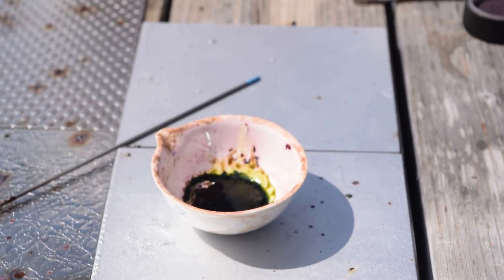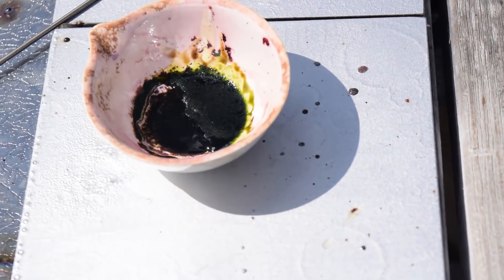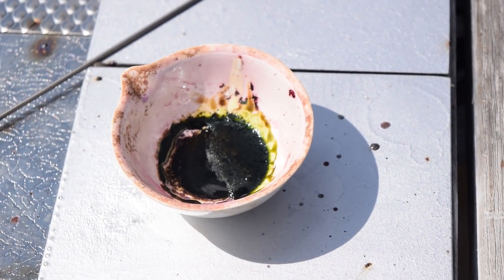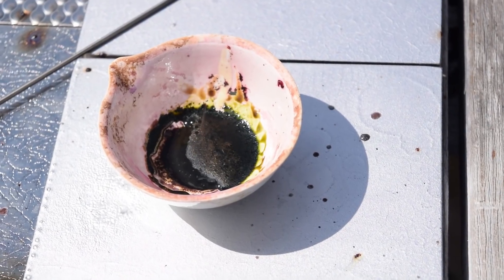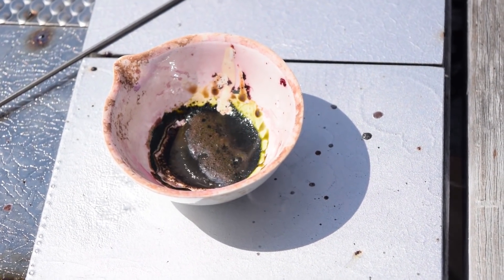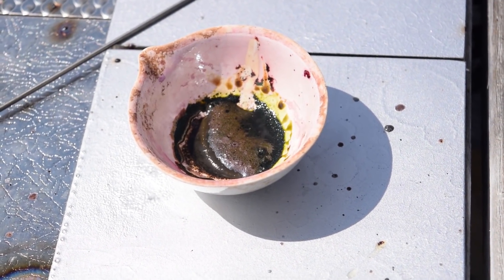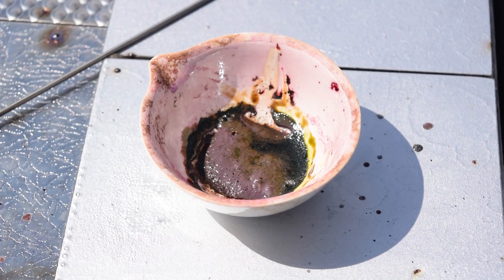I don't know if you're able to see it, but it's like eating away at it. It's probably because it's immiscible — that would make sense. Very unusual.